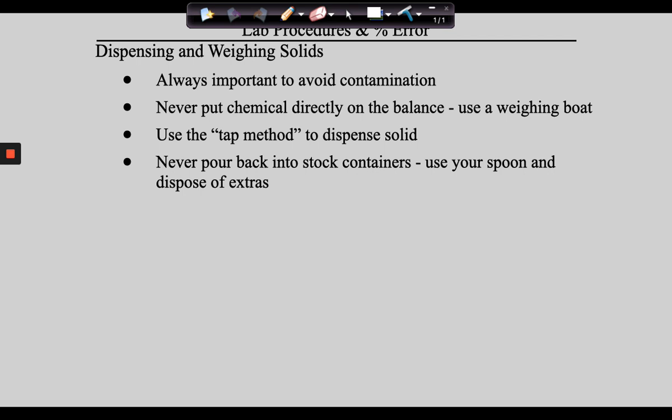Now guys, what if this scoop did not come with the beaker? How does that change the game? Then you can't put the salt back in the beaker because this is contaminated. So what do you do with the extra salt? It goes in the trash. So guys, that's the tap method.